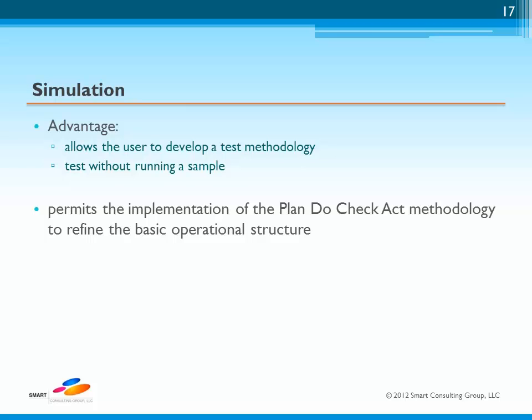Finally, let's just talk a little bit about simulation. This is just another very useful technique in the arsenal of the prudent approach to developing a lean laboratory. The major advantage to this approach is that it allows the user to develop a test methodology in a virtual world without actually running a sample.